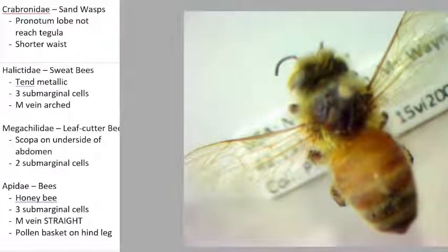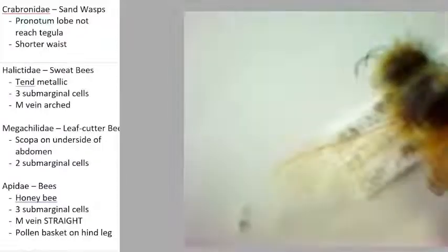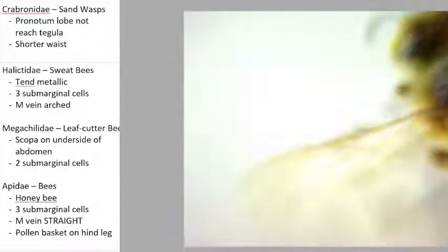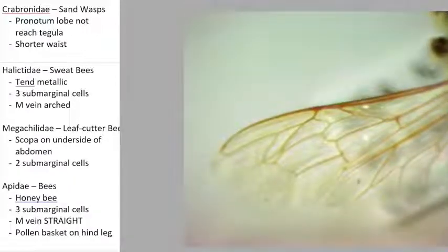I just think looking at insects under the microscope is kind of the coolest thing that you can do all day. All right, so we're going to be looking down here at the wing venation.